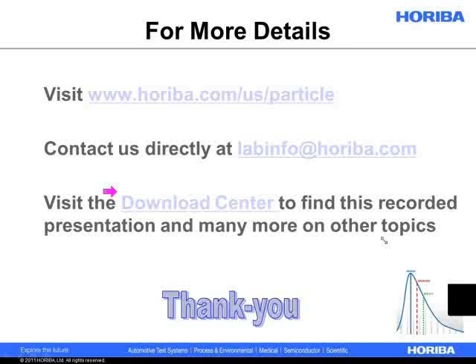50+% of materials. And then you want to know a little something about the material, because the next thing we want to specify is the imaginary component of the refractive index, and that has a lot to do with how strongly the particle is going to absorb light, what shape the particle is, how much it might reflect light. So if you're measuring a transparent particle that's a sphere, like a glass bead, or a non-absorbing polymer, the imaginary index is going to be 0.0. That's kind of a nice trivial case. If you're measuring something like carbon black, the imaginary index is going to be greater than 1.0.